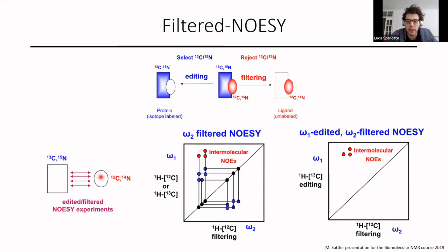On the other side, we have experiments where you can check also your protein. And these experiments are also useful because they go much more in detail on the binding, if there is binding, but especially the mode of binding of our molecule. So these are based on the NOEs. Again, the same concept that you can see which atoms are next to each other.